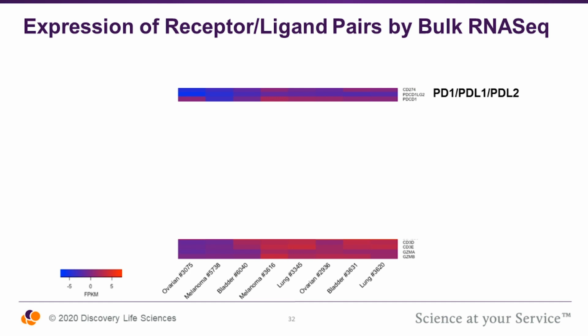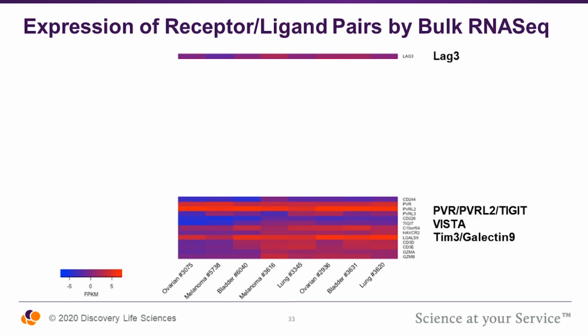So if we look first at PD-1, PD-L1, PD-L2, we see at the RNA level these are all expressed, which confirms our flow cytometry data. Interestingly, PD-L2 is very lowly expressed, although we did define some expression levels, which was pretty unique. We did look at some of the co-stimulatory molecules. In general, we found the receptors to be expressed, but not the ligands. We did confirm this by flow as well. I'm not going to go through that data today. Instead, I'm going to focus today on the other co-inhibitory molecules that were expressed within the tumor.